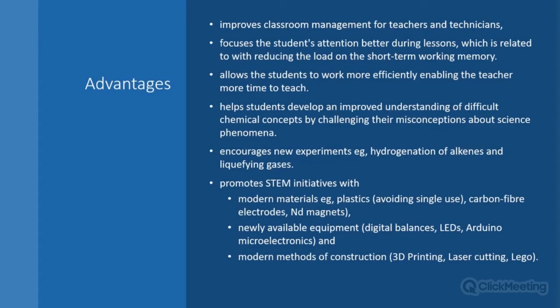So there we have it. So these were the extra things I found as an advantage to doing microscale. The classroom management. Notice we sit down to do all these experiments, which makes management quite easy.